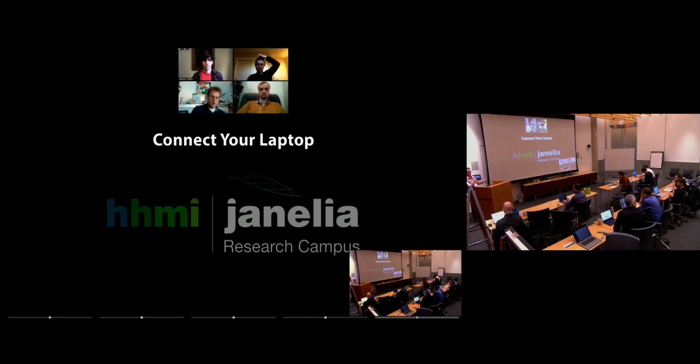So how do you upgrade or add something to a driver that's part of a group without breaking functionality across other devices? Now I'm way off in the weeds, but it's certainly something that I'd like to chat with people about. Downside of ACQ4, just like we heard, Python 2 versus Python 3: the conversion is a work in progress, but I think it'll be doable.